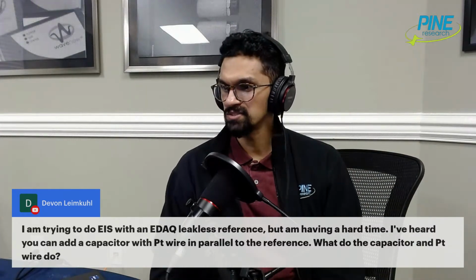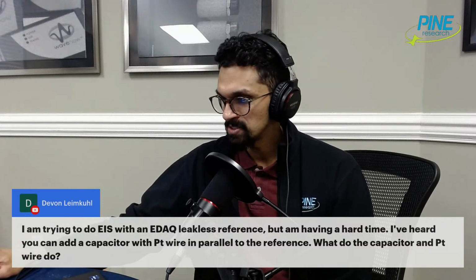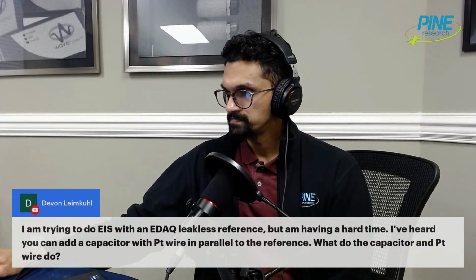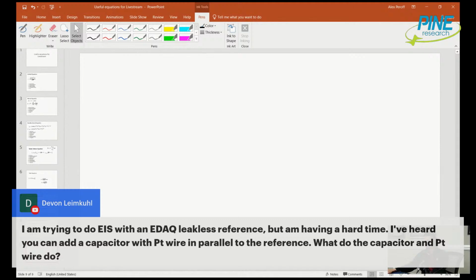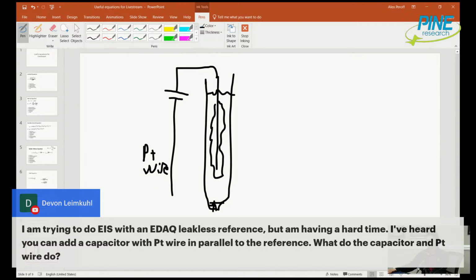Okay, so Devon's asking about a leakless reference electrode, and he wants to add a capacitor. Yes, so this is what's known as a reference electrode shunt. Let me describe this. What's happening is you have a reference electrode, and it's leakless. I don't know enough about the technology, but I'm assuming maybe it's silver chloride, and you just have some kind of special magic frit that makes connection to the solution. You have silver chloride in your reference electrode, and then you have it in parallel with a capacitor and a platinum wire. So this is a platinum wire. And this is typically used for EIS.